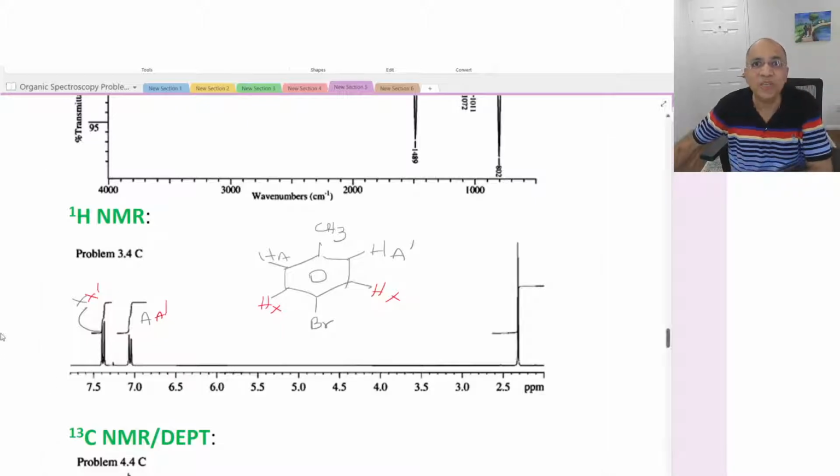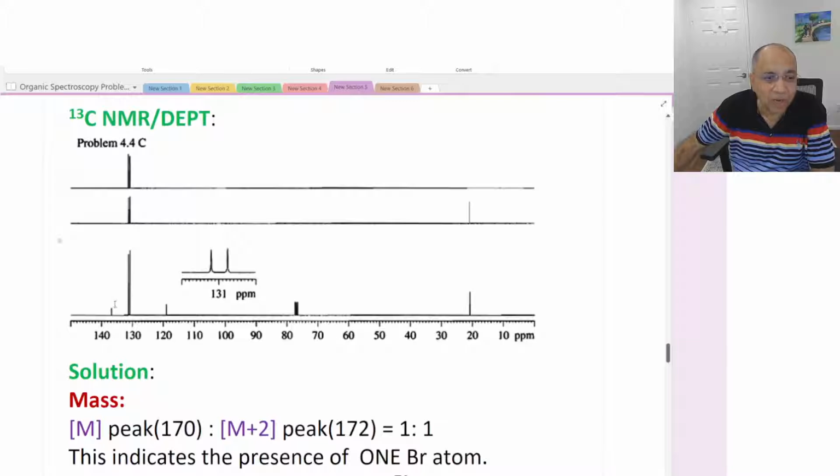Let's now look at DEPT. The C13 NMR in the aromatic region shows only 4 peaks. The little dwarf peaks are for the quaternary carbons connected to no hydrogen. That means for the disubstituted compound, those carbons are quaternary. And these two tall peaks are CH. How to know it is CH? In the DEPT, this is DEPT-135.